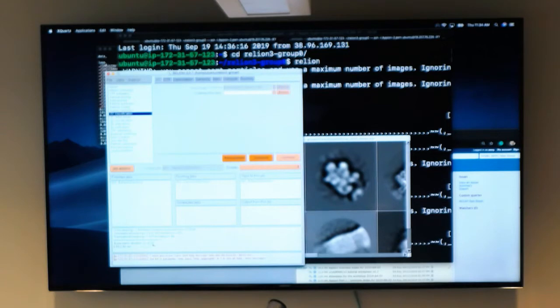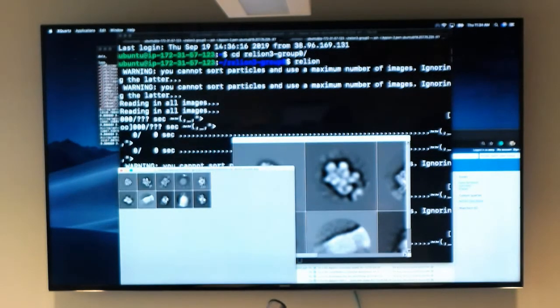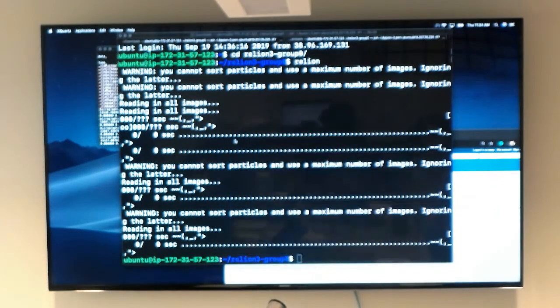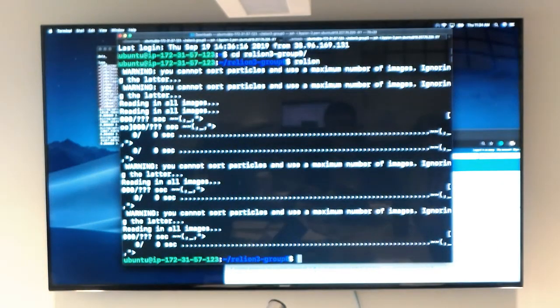So right now I'm at 23 out of 25 iterations. If I feel that that's enough, I could actually stop it and just move on. And for the tutorial, that's perfectly fine. You know, I can just see what the processes are doing, and I can just kill it.